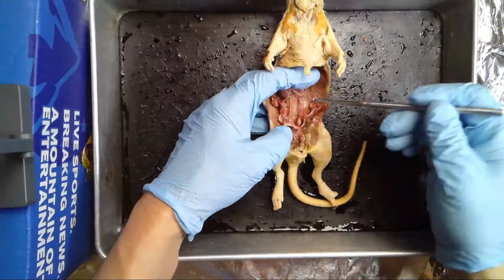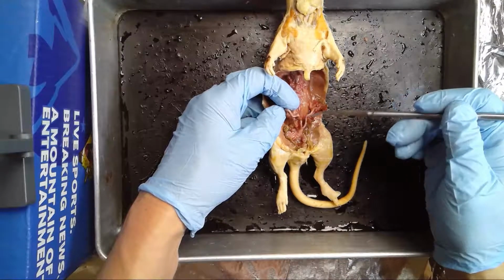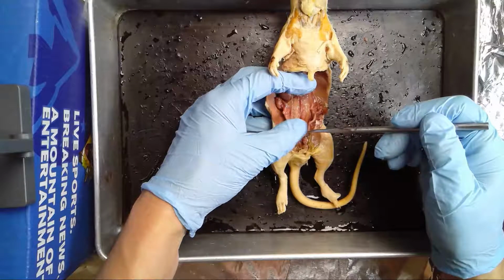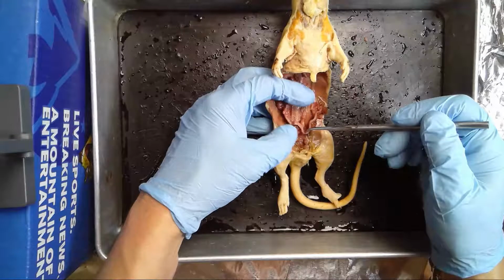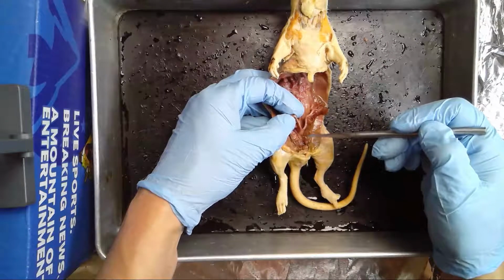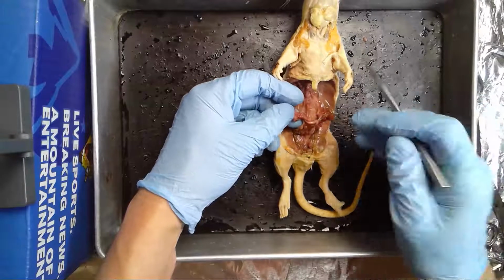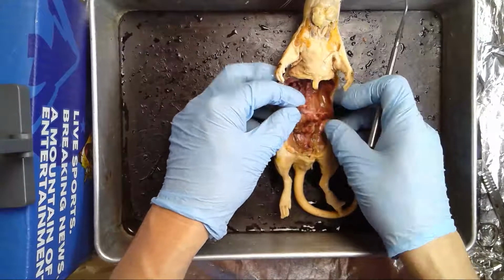So the main things you can see here are the uterine horns. They have a sort of slightly spiraled appearance. They form the body of the uterus, which is right here at the base of the Y, and from there you connect up to the vagina. Now, if we look at the ends of the uterine horns, we can find the ovary. So the ovary is right here.